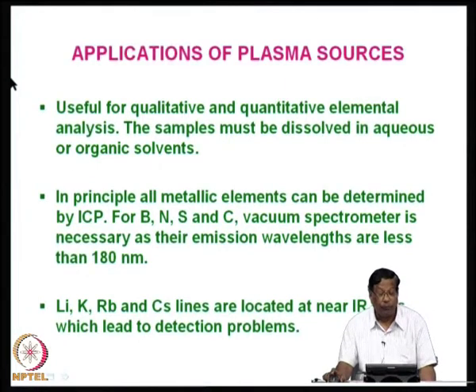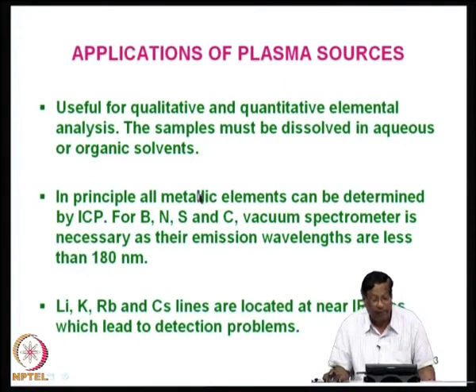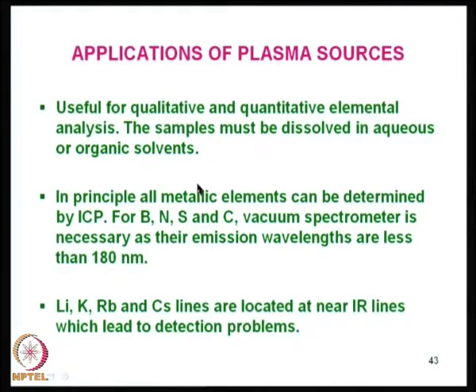So, the applications of plasma sources are also varied depending upon the requirements of your analysis. For example, as I was explaining to you, for qualitative and quantitative elemental analysis, ICP is very useful. Pass or fail test.